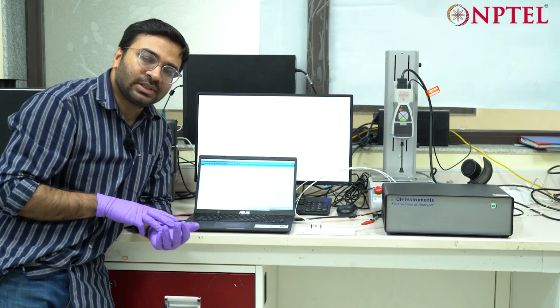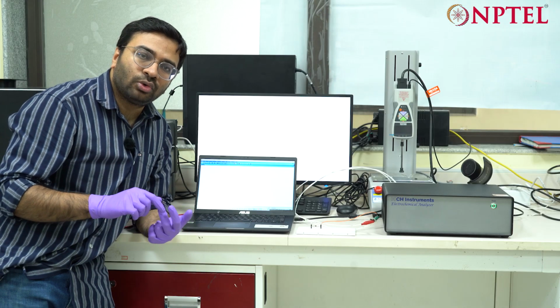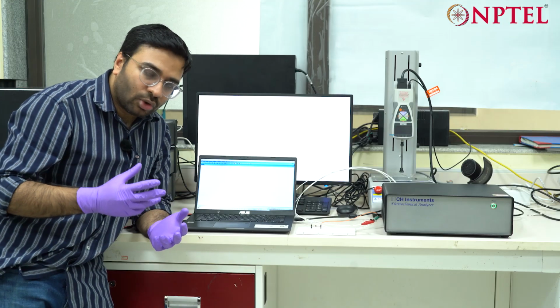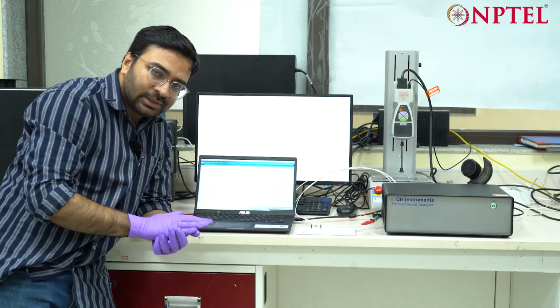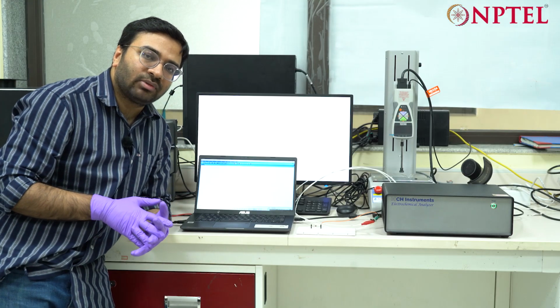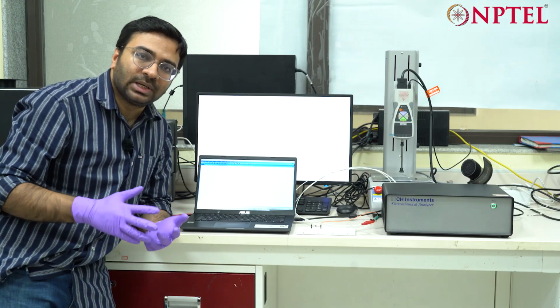Usually those sensors have 3 different terminals: one is the counter electrode, the reference electrode and the working electrode, and then you have a ground electrode also. That is why this instrument has 4 different terminals, and apart from that you can also do electrochemical response characterization using 2 terminals as well.